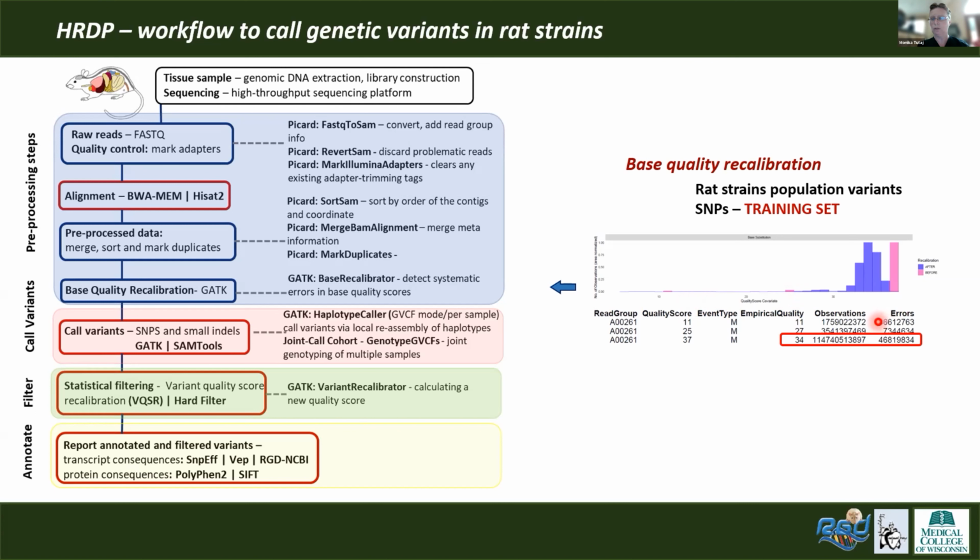What you want is to use a rat training set and adjust the quality score per base based on real data, and the data should look like a normal distribution. Basically all those 48 samples dropped in quality score by 1 to 9 points. So it is one of the steps which eliminates false positive variant calls in future.